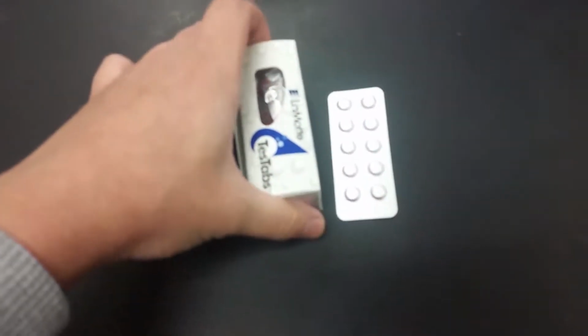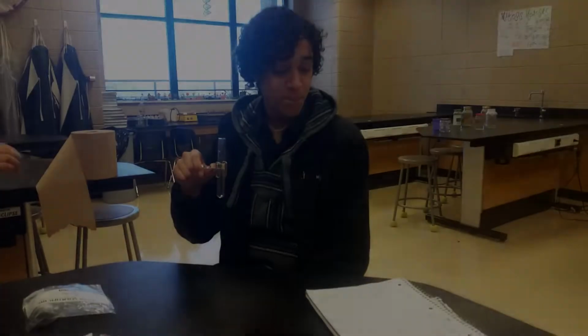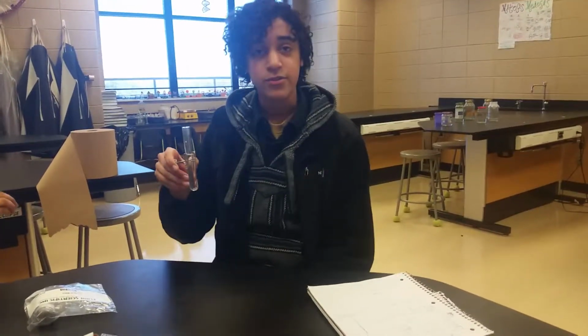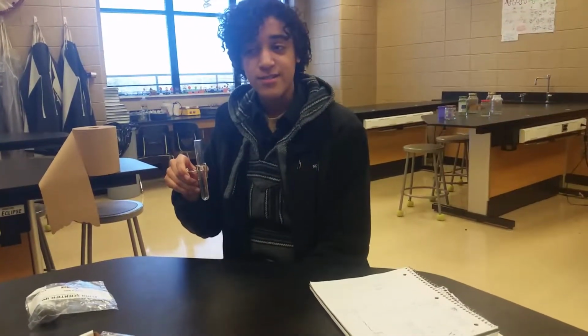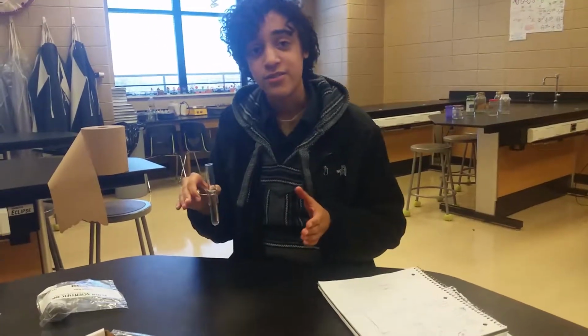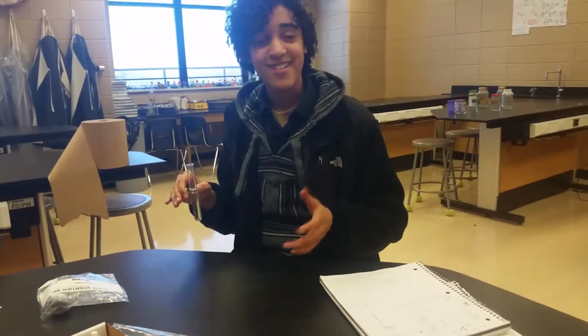And here we have the nitrate. And this is what we use to look for the nitrate. And here's an example. Test 1, nitrate. So nitrate, there is no direct effect in rivers and streams on how much nitrate it takes to create a hazardous environment.